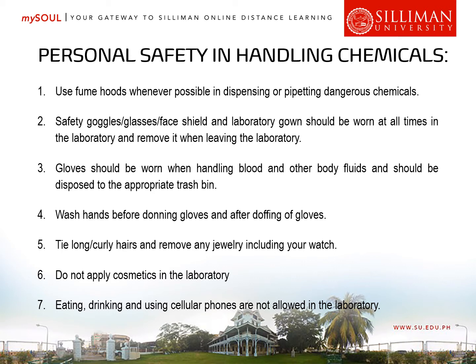So usually for soiled gloves, you have to dispose them in infectious waste. So that is your waste container with a yellow lining. Also, when your gloves are already torn, you have to replace them with new gloves. And another thing that we need to remember is before we wear our gloves, we need to check first our hands if we have visible wounds, and we have to cover our wounds first with band-aids before we wear our gloves. Number four, wash hands before donning gloves and after doffing of gloves.